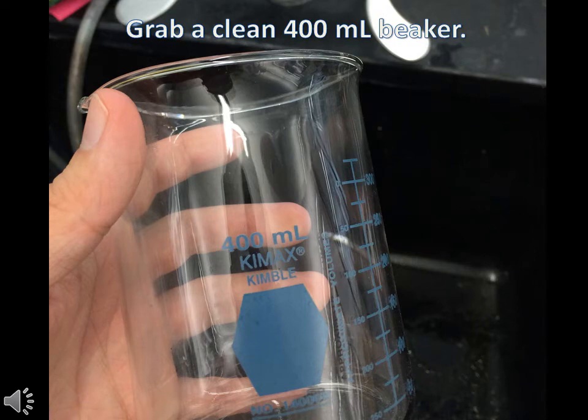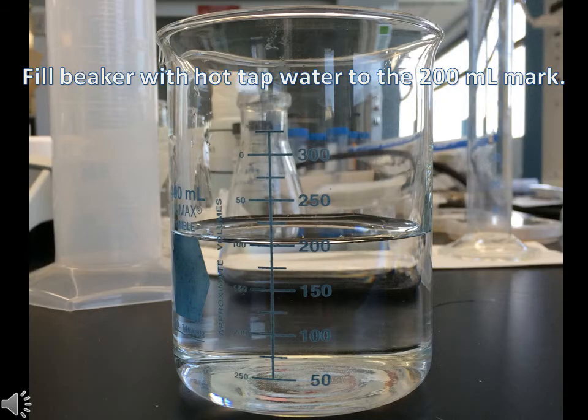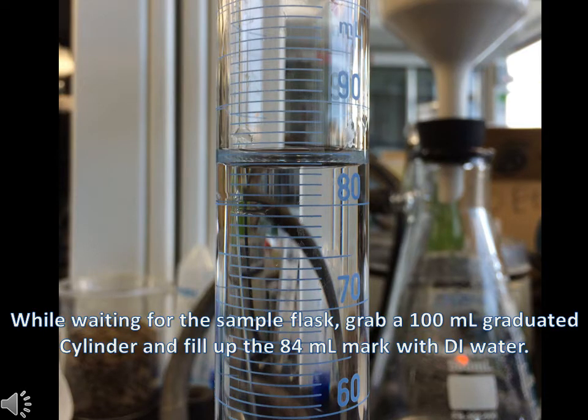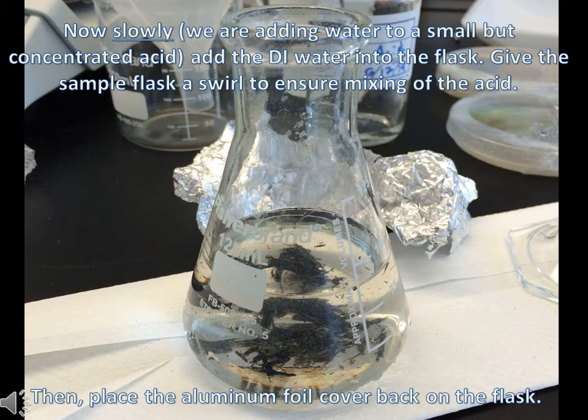Grab a clean 400ml beaker and fill it halfway with hot tap water. Cover the flask with aluminum foil and submerge it in the hot water beaker for 30 minutes. While waiting on the hot water bath, fill a 100ml graduated cylinder with 84ml of deionized water. After 30 minutes, slowly add the deionized water to the flask, then recover with the aluminum foil, followed by swirling the flask to mix with the acid.